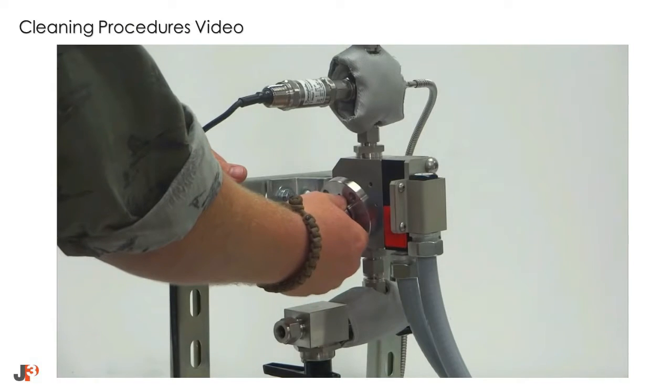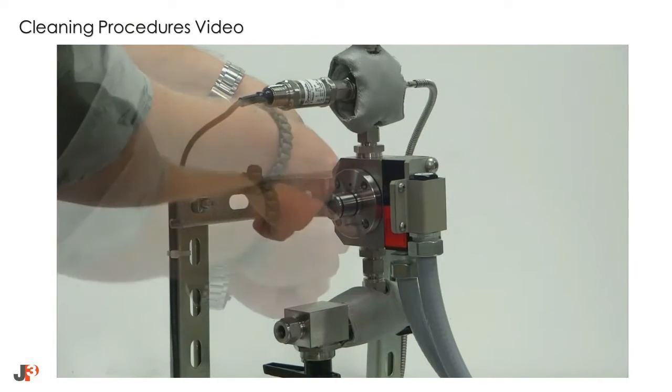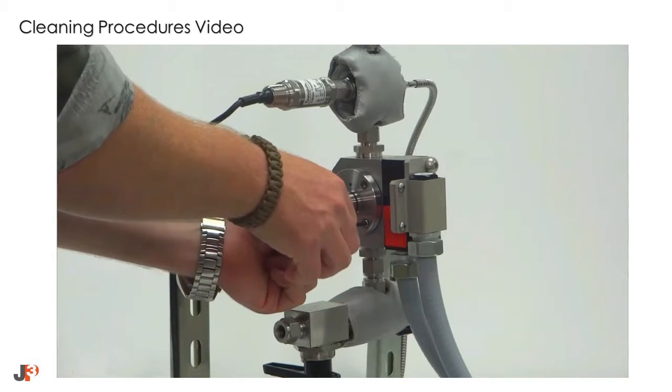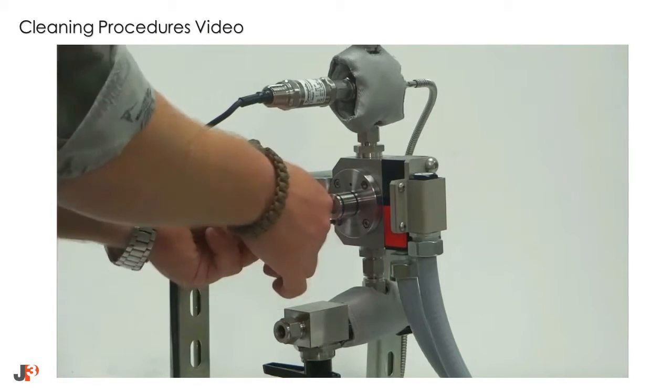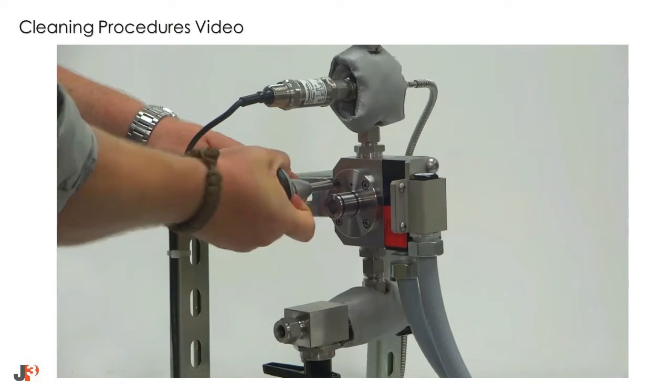Next, reinstall the flange. When reinstalling the flange, tighten the screws in a 1-3-4-2 pattern. Torque each screw to approximately 30 inch-pounds, or hand tight plus an eighth of a turn.